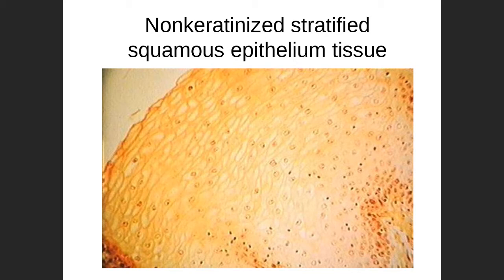When you prepare a slide, you are taking a 3-dimensional structure and you're making it 2-dimensional, all right? So when you make these slide preparations, you're going to be missing certain things, okay? So if this is the nucleus right here, and here's the nucleus over here for this cell, and here's the nucleus here for this cell, and here's a nucleus for this cell, and here's a nucleus for this cell. And what we do is we take the slice, we cut right down this area, okay? So say this slide right here that we're looking at is the slice that I just drew.